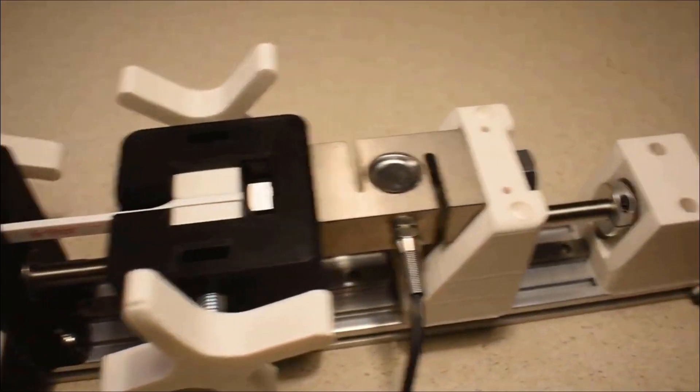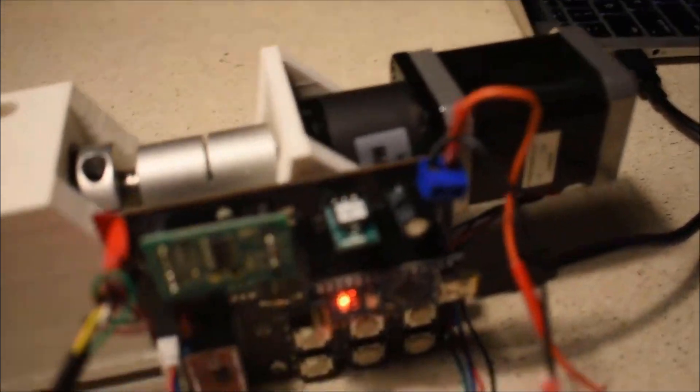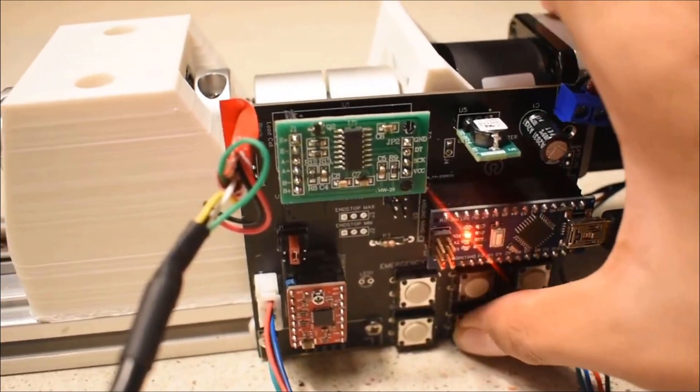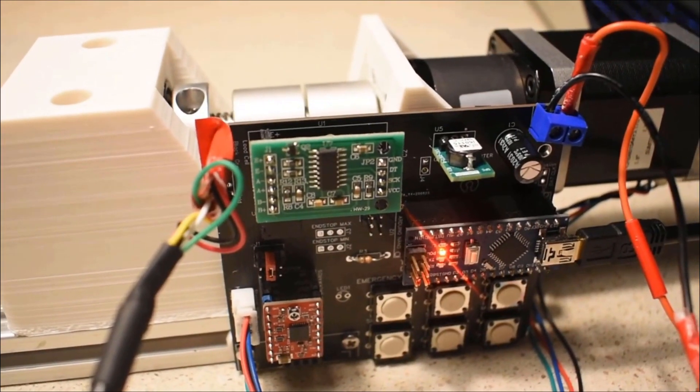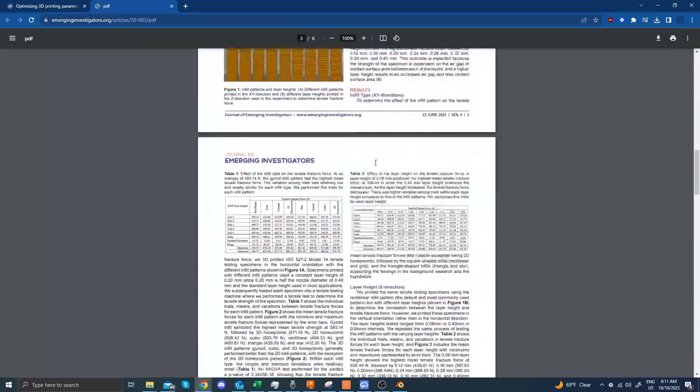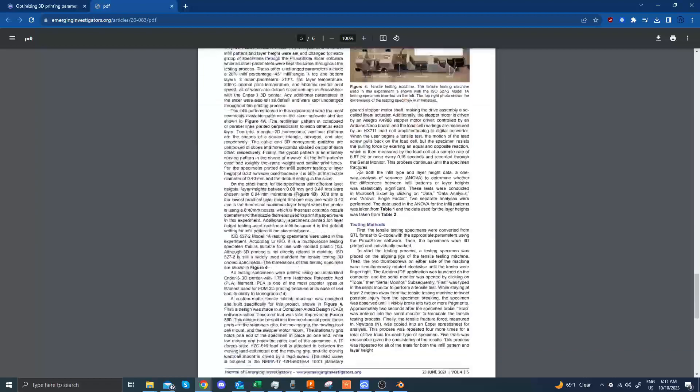I made this machine in 8th grade, and I am still improving it today as a high school senior. I have done two research projects using two variations of this machine, one of which was published.